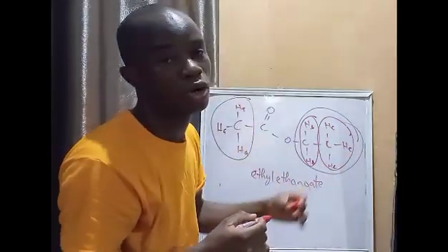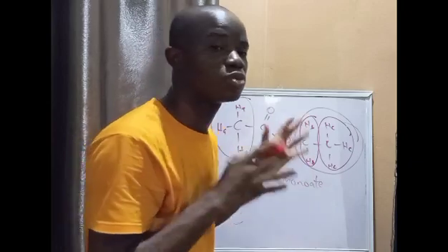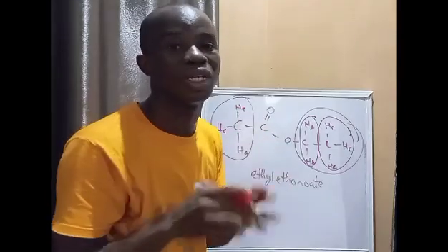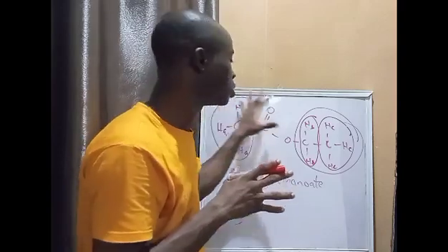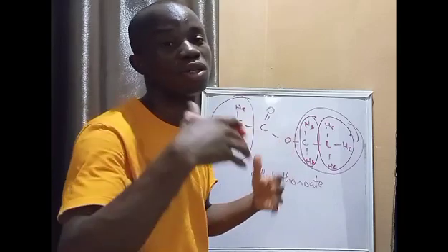So in this particular compound, I'm having three different kinds of hydrogen, which means that the NMR spectrum for this particular compound will produce three different signals. That's what that indicates.